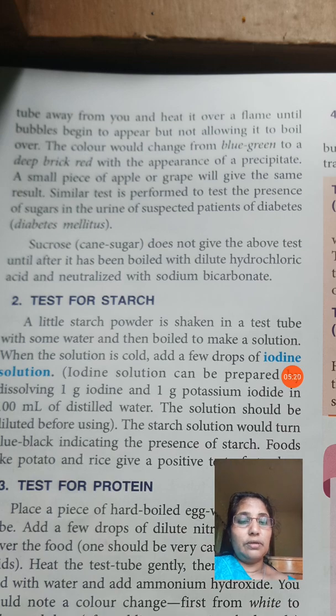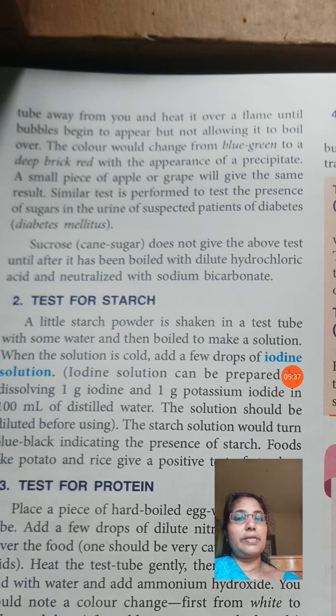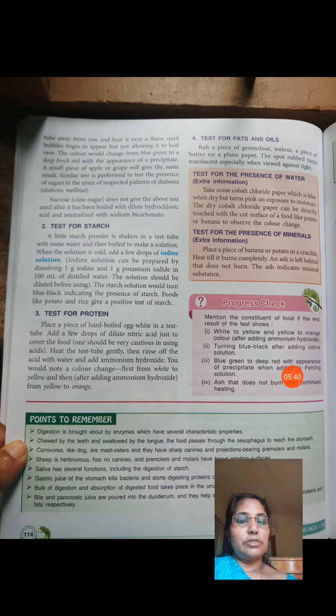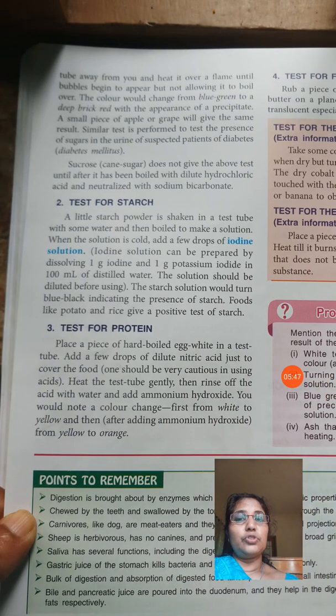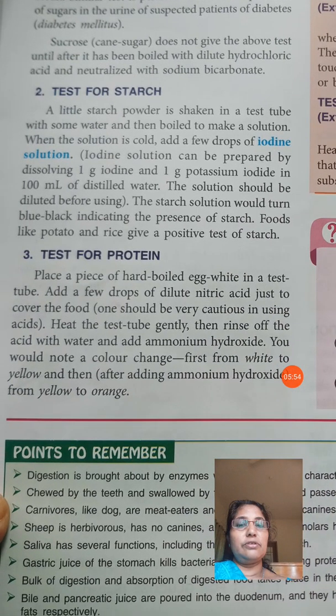You know the brick red color, what is it? You know the color of bricks. So it will change from blue green into brick red color if sugar is present. The same test is done in diabetic patients. In diabetes mellitus, you know, there is the presence of sugar molecules in the urine. The same test is done for sugar patients. Then again, test for starch, you know. Then test for protein.